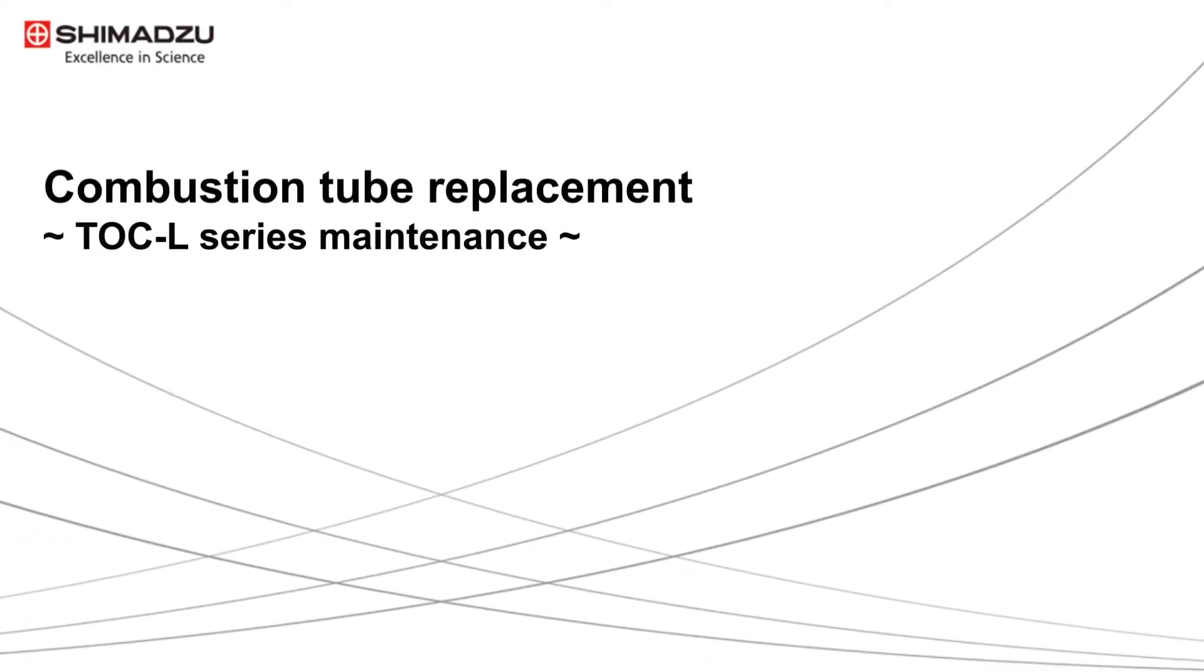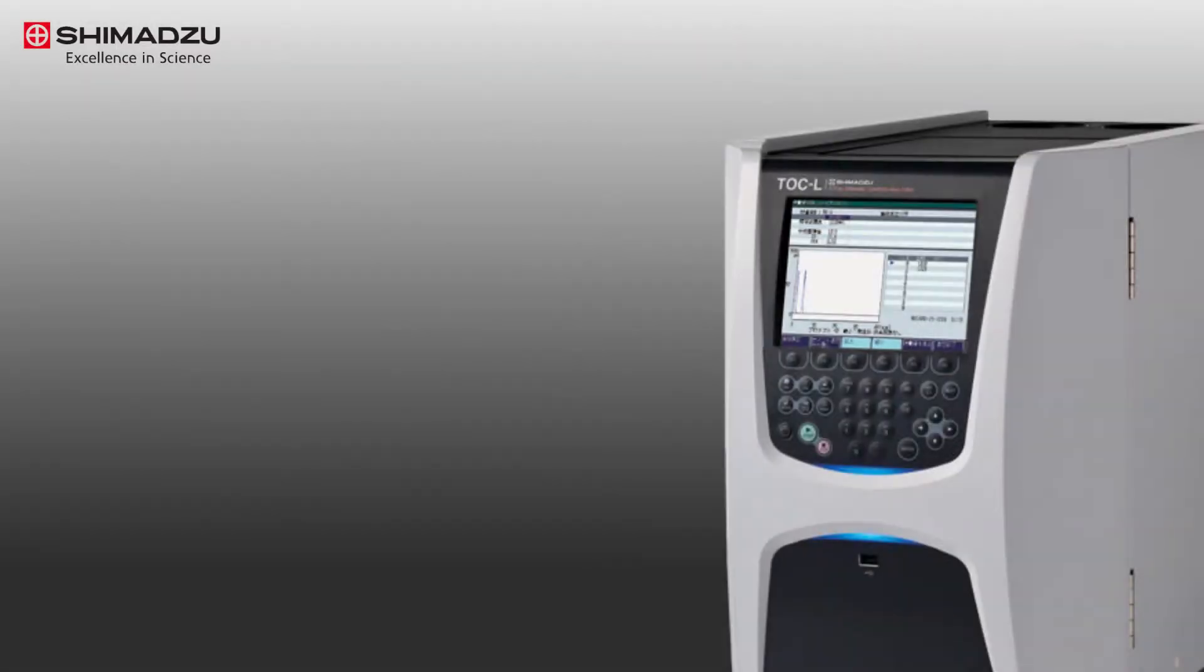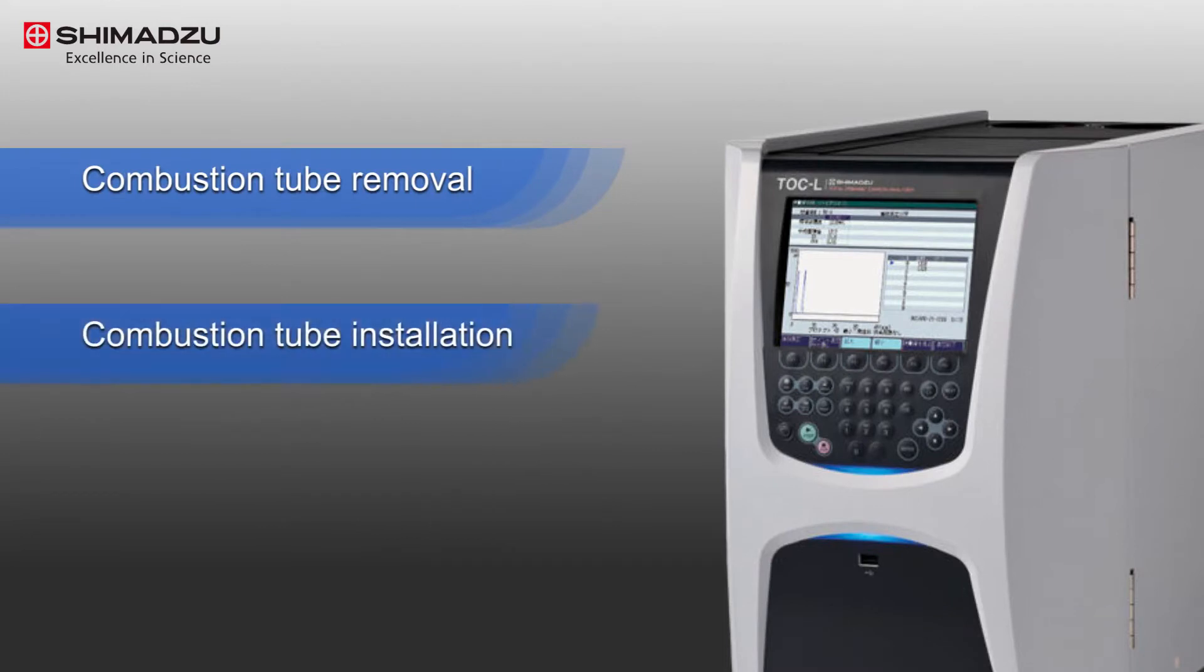This video will demonstrate the combustion tube replacement process for the TOCL series instrument. There are two processes in this video: the combustion tube removal and combustion tube installation.